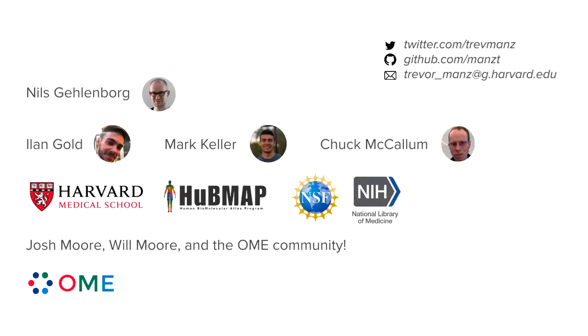Okay. Anyways, great talk. My question is, it's great to be able to search stuff up over the web, but at some point locality matters, right? So do you have a sense of where that trade-off starts to come in? How much are you going to use a particular data set to bring it onto local storage, because you're going to process it 100 times instead of once?